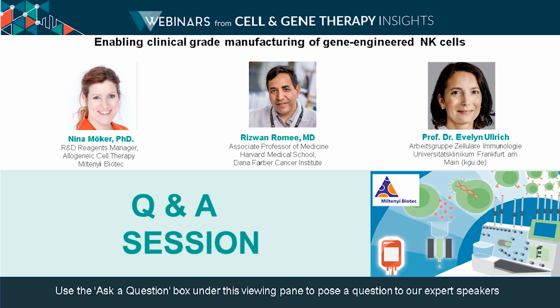Thank you, Evelyn. And regarding the analytical tools, what is the current state of the art and where do you hope to see further innovation in this regard? Rizwan, do you want to kick us off there? Yeah, in terms of the current workflow we have for analyzing our products before they're released, it is manual flow, and that's, again, very cumbersome.